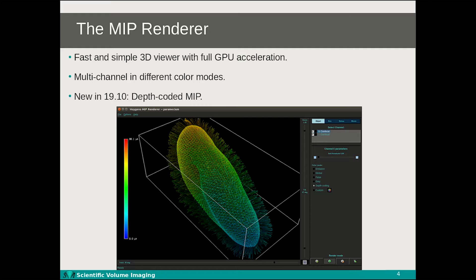A new feature in Huygens 19.10 is the so-called depth coding color mode. Each point in the MIP is colored according to the distance from the viewer. As you can see, one end of this paramecium is colored blue since it's closer to the viewer, whereas the other side is colored red because it's farther away. A scale bar for this color mode can also be added to translate the colors into real-life depths, running from blue at 0 micrometers to red at 98 microns.